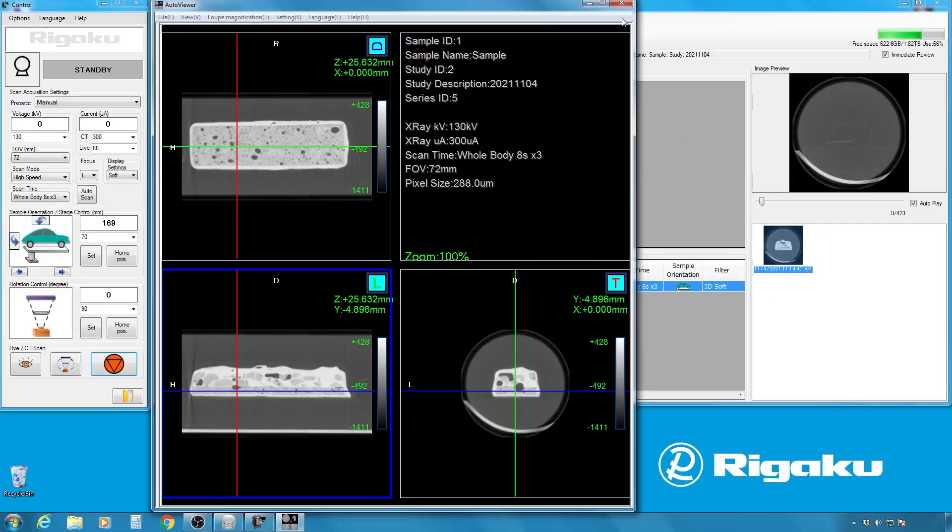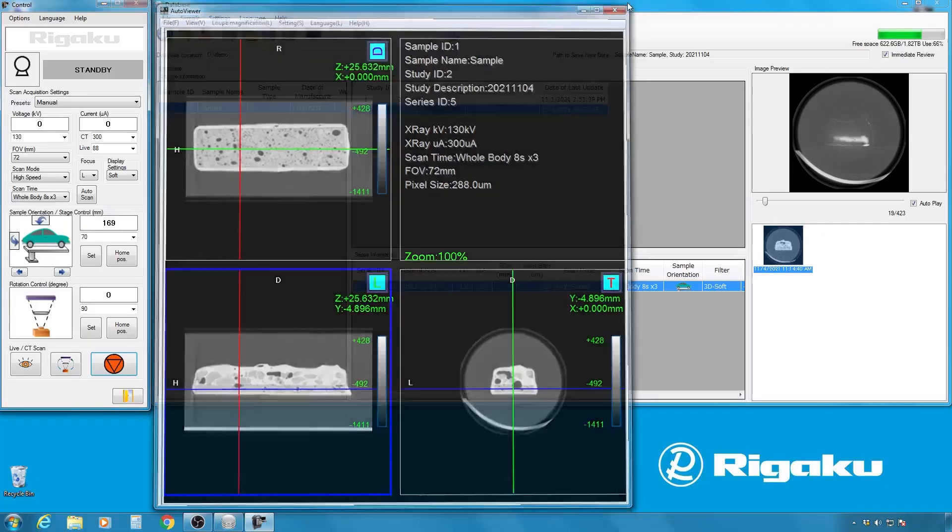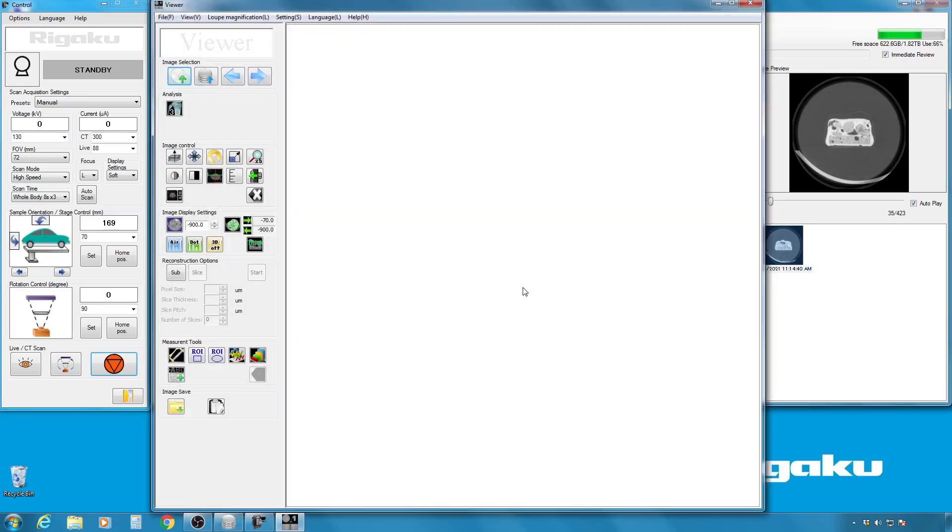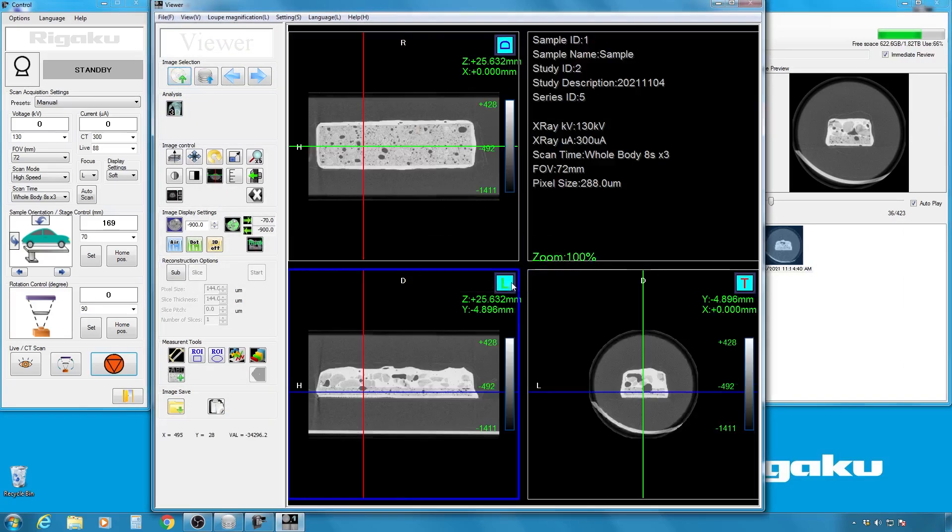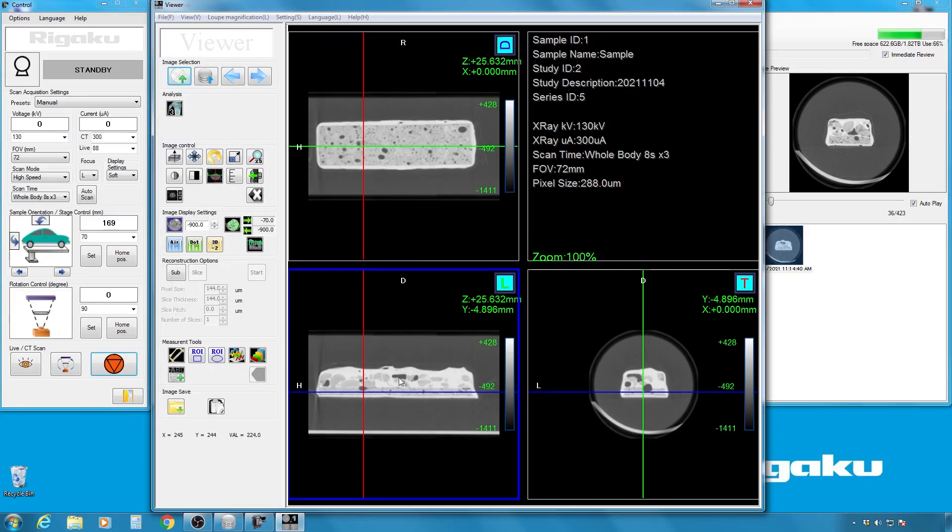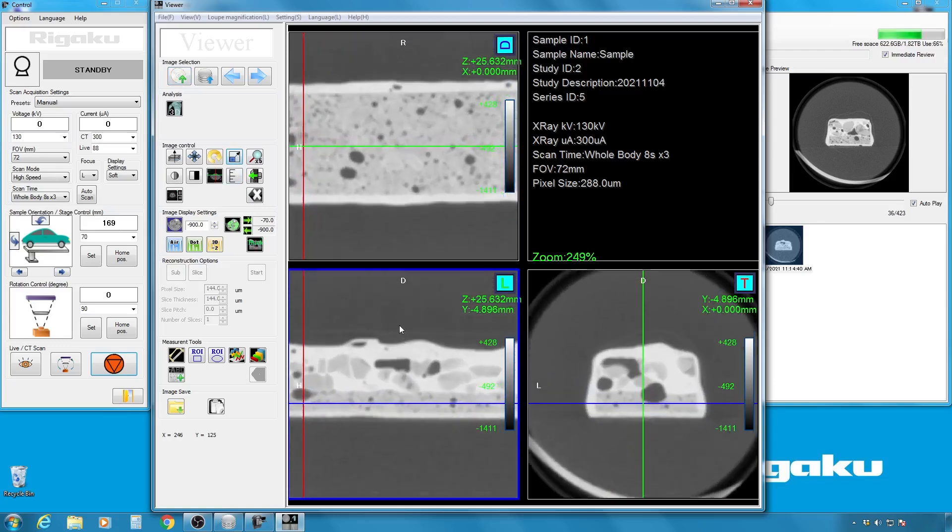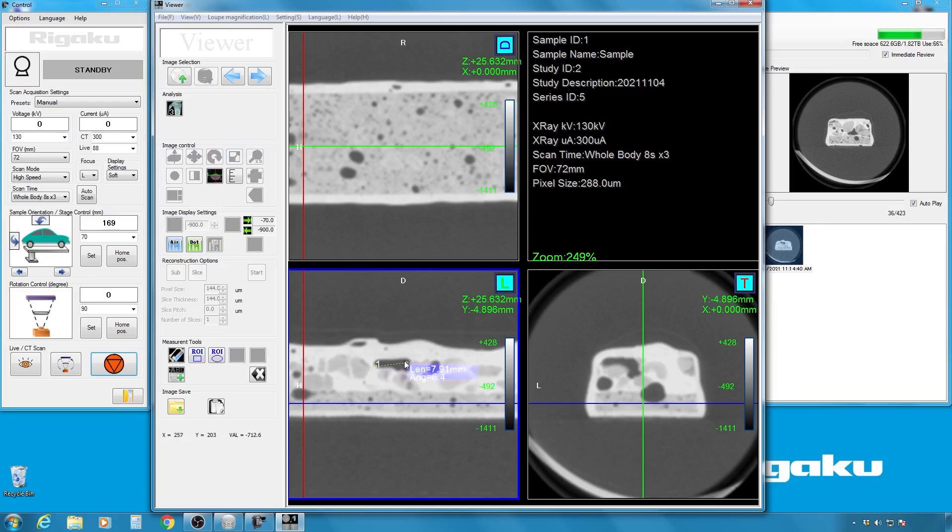Now, once you have this image, you can analyze a few things. For example, if you want to look at the size of this air pocket, you can zoom into it. And take a ruler, for example, and do this. And you see that this one is about 8.8 millimeter.